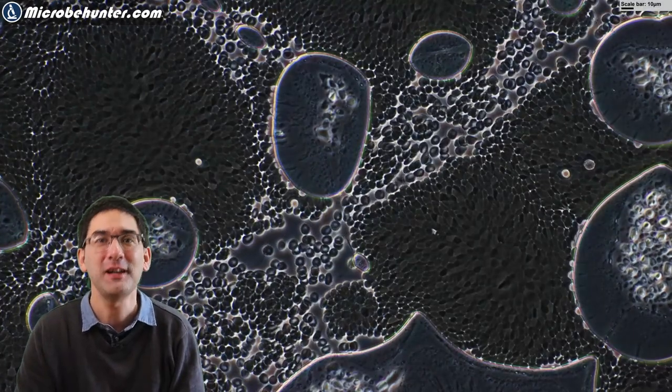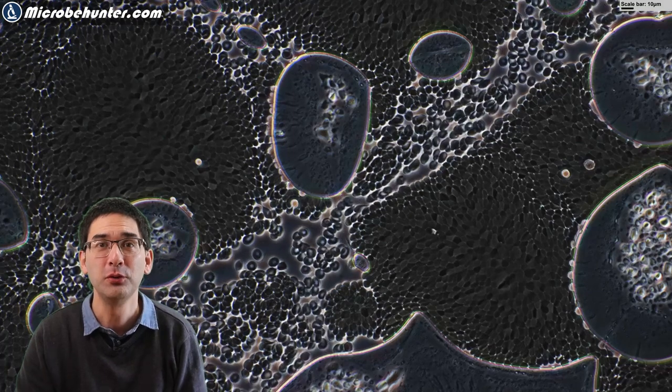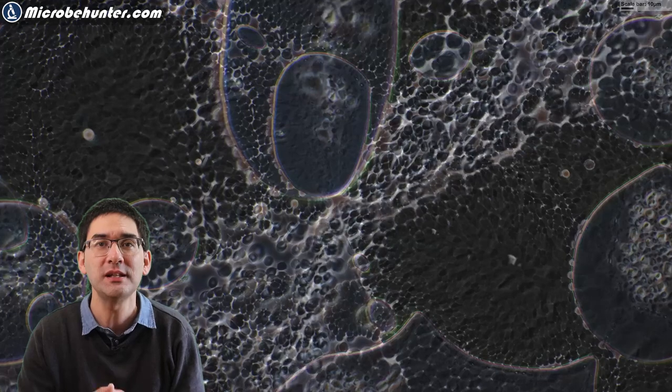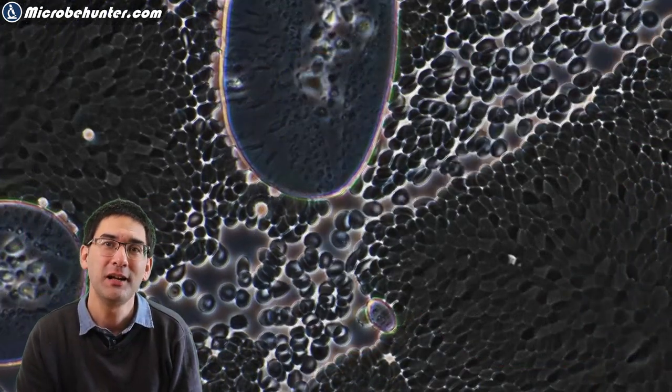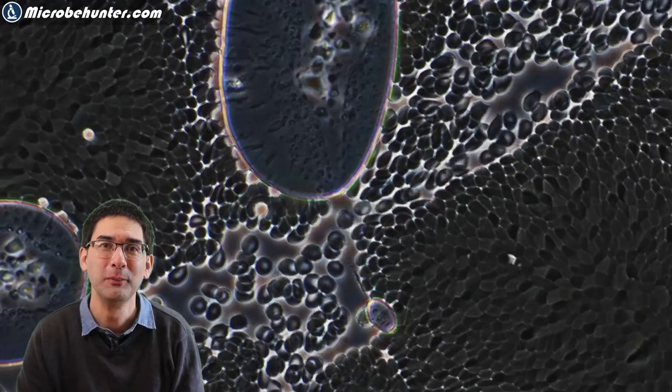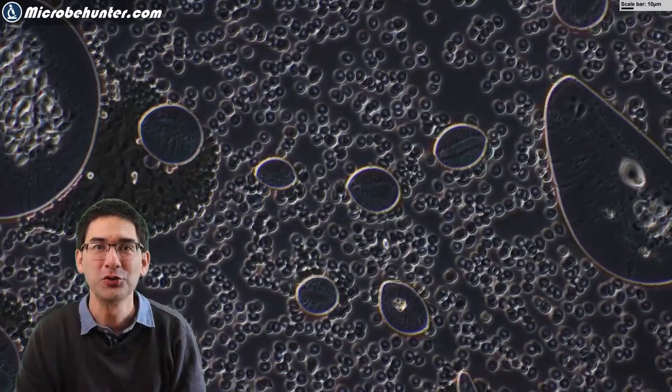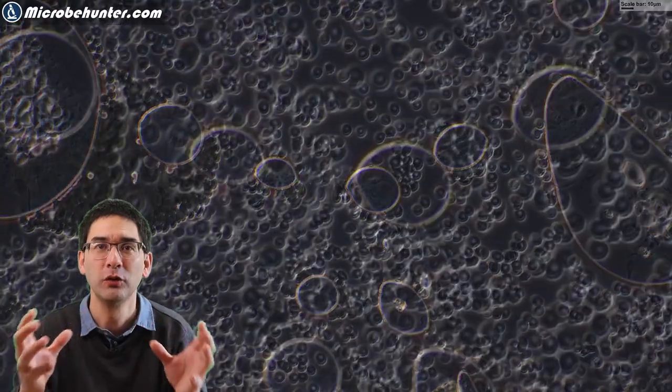This here is in phase contrast. I think it looks quite beautiful. Phase contrast microscopy is used to increase the contrast of very weakly stained specimens. You see that over here, the blood cells look again a little bit different. They almost look like they have a bright ring around them. And here also some of the red blood cells flowing around air bubbles. These are the oval round structures.